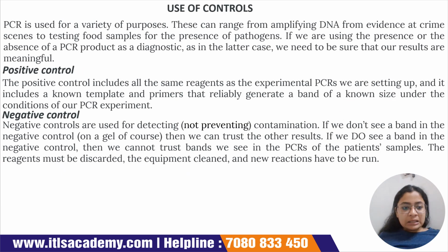Okay. Now coming to use of controls, positive and negative control, very important. So positive control क्या है? Positive control मतलब जिसका result हमेशा हमें positive दिखेगा. तो क्यों वो important है?